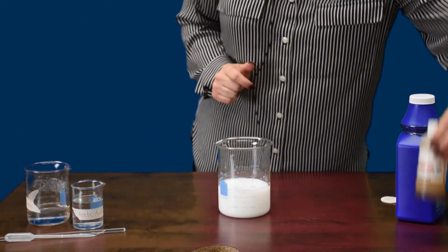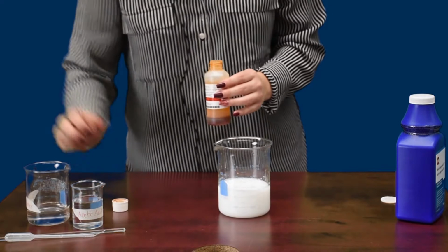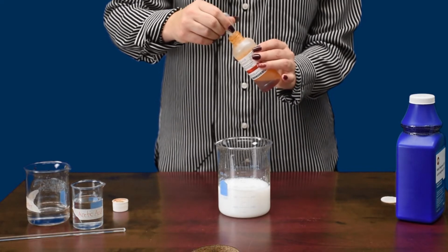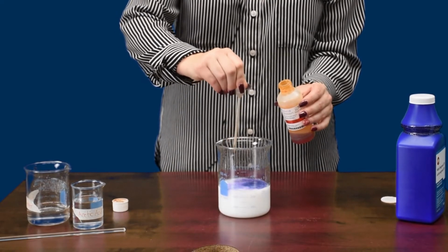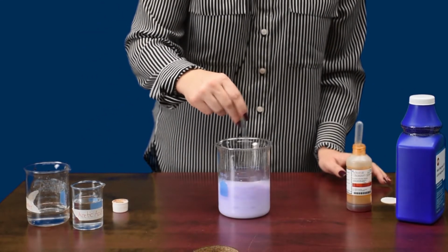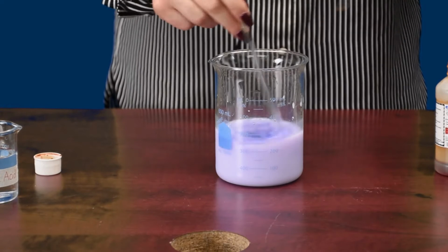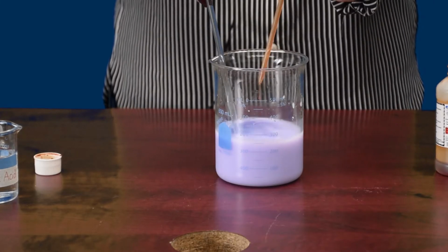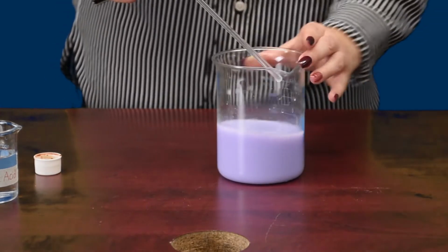Okay, next I'm going to add a few squirts of the universal indicator. And while I'm doing this, I want you to think about what is universal indicator? What is it used for? Going to give that a stir. I'm just going to add a little bit more of the universal indicator because you want it to have a nice, good purple color to it. Okay, so it should look to be a nice purple color like this.